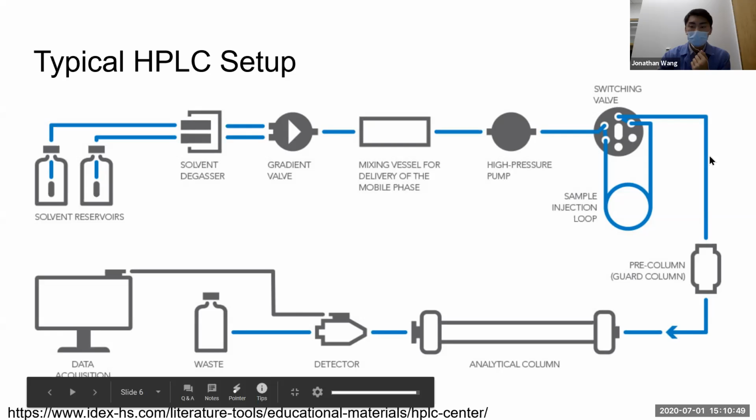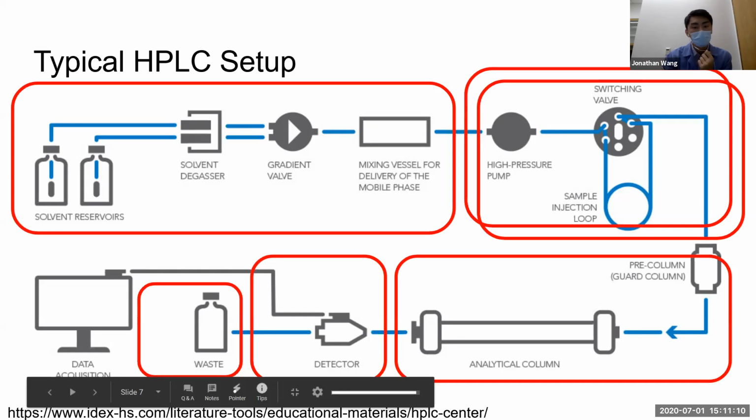And this is finally passed through a column, which is the part doing the chromatography. And finally to some detectors that'll look at the color of your sample. It's more robust than just the color. So you're actually going to detect particular wavelengths of light going through your sample, but it's basically the color of your sample. And our boxes that you saw earlier are kind of self-contained portions of this flow diagram.